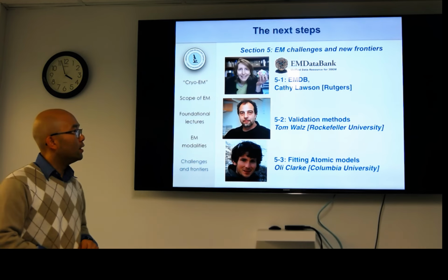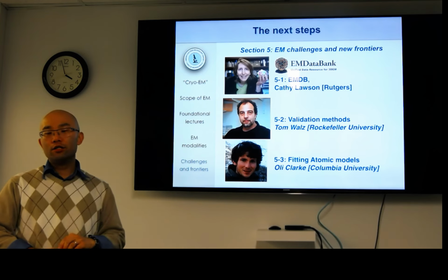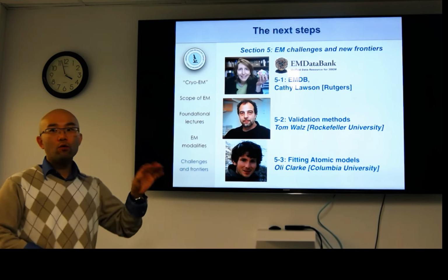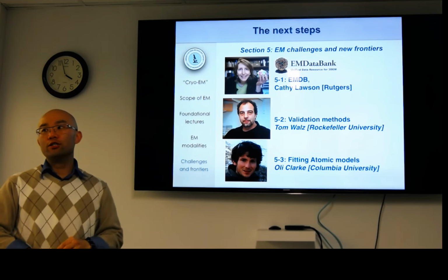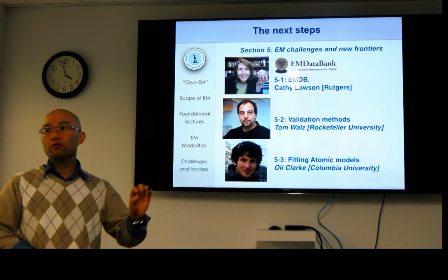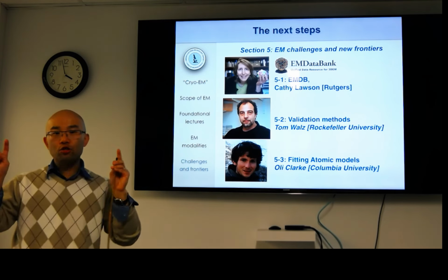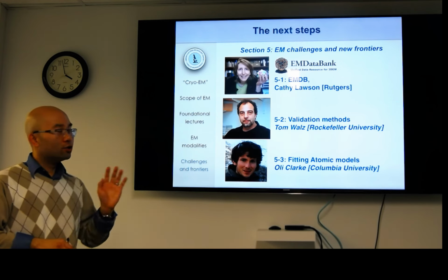The main thing is that if you're trying to answer a question, and let's say you know at 3 angstrom resolution you can solve that question, do you have enough validation methods and a way of reporting that such that a person knows that there is a particular resolution range that can answer their question? If they know in X-ray crystallography that their question can only be solved at 2 angstroms, then how do we report statistics to a reader to know that this EM map is of comparable resolution, as it were, such that they can solve their question? And that is still very outstanding.